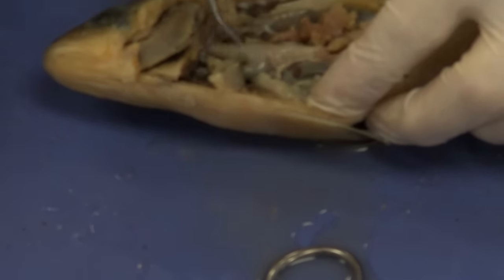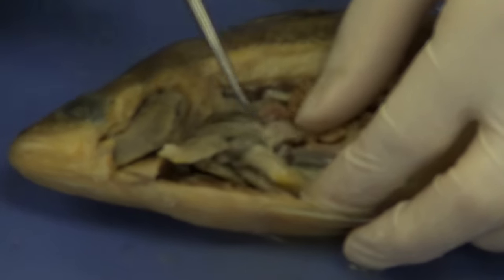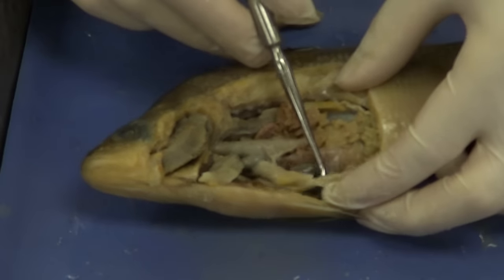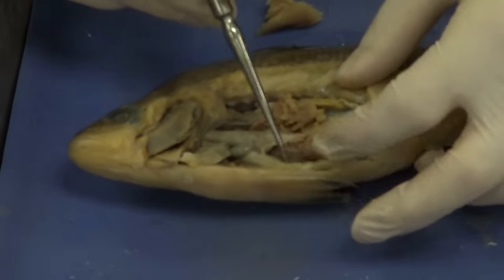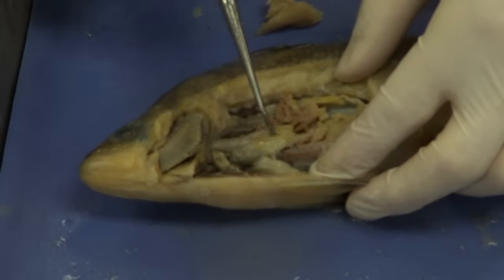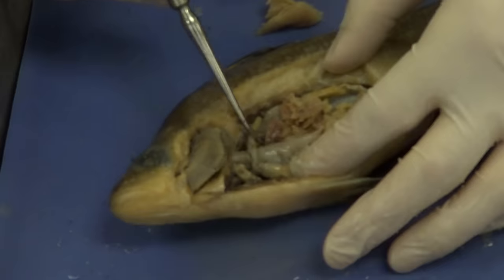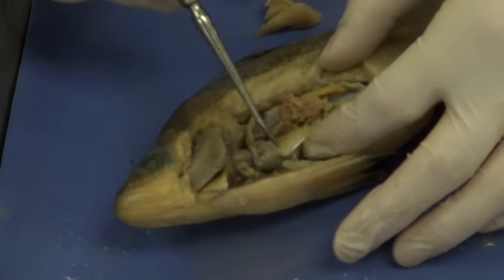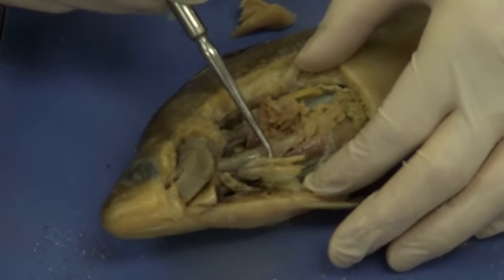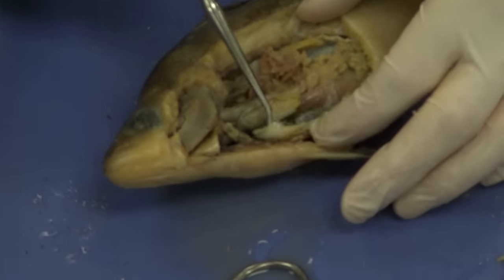The stomach then leads into an intestine, which is going to coil around a little bit, and ultimately we'll pick it up right here. Before we do that, we're going to see some projections — some finger-like projections. There's one right there, and there should be another one right there. These are the gastric cecae.